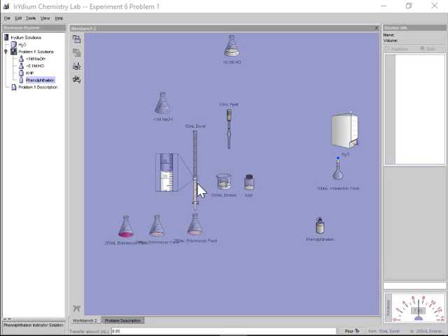And in fact, I'm going to demonstrate for you how I'm going to do this dilution. I'm going to dilute it a little bit more than I need to. Hopefully, I'll get more than that 10 milliliter titrant volume, and you'll see that we actually get one more significant figure out of it.